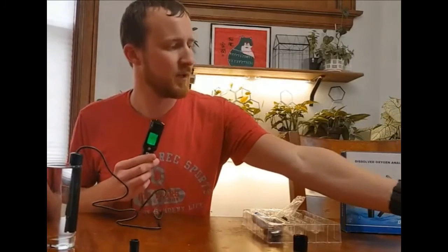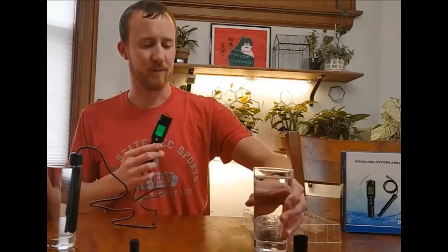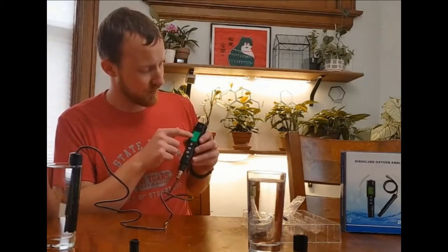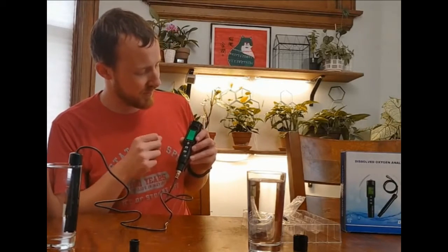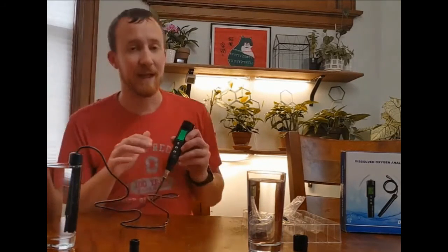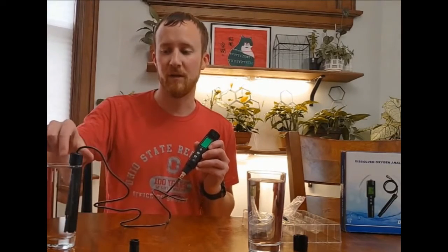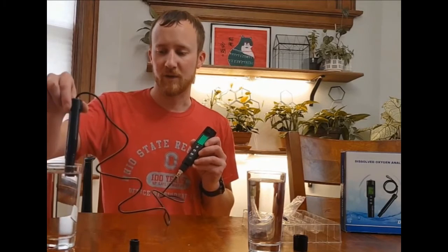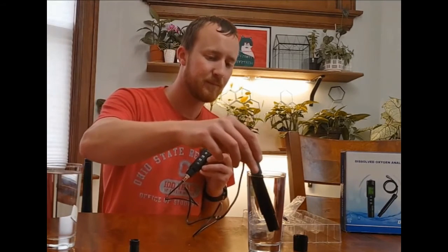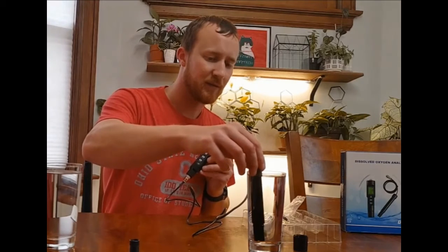Over here I have boiled water, so we'll measure that in a second. It's going down from 83.9% or 7.9, and I have not calibrated this at all. I'm going to switch that over just so we can see it working here right out of the package without calibration.